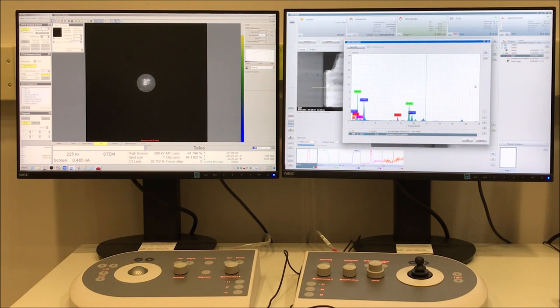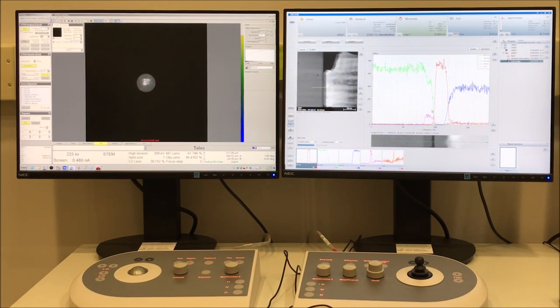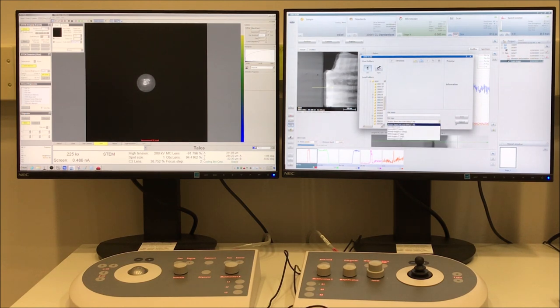as done previously. I would like to state, though, that before you stop the scan, make sure you have all the elements selected that you want in the line. You can also see that reduced area. And now if you right click on the composites, you can save the line scans in a raw data format if you want to replot them.